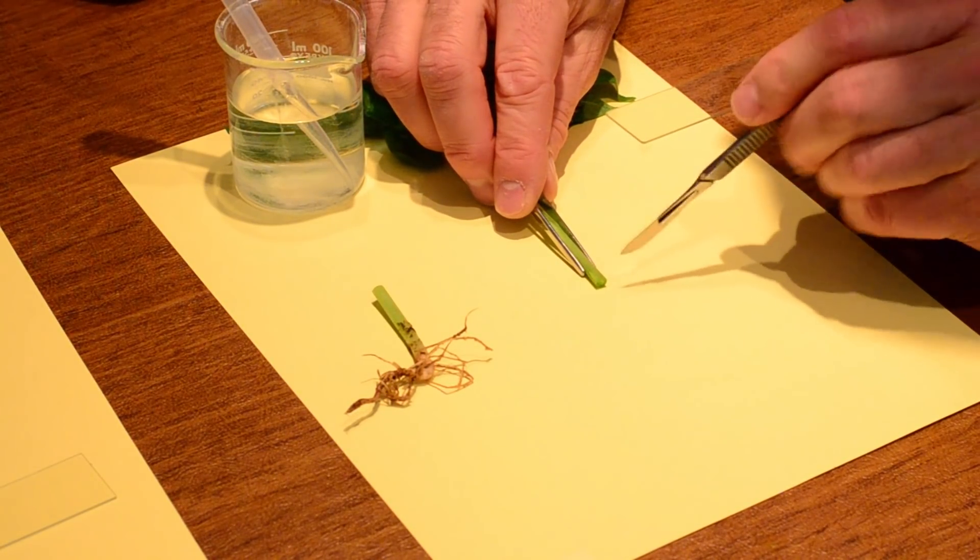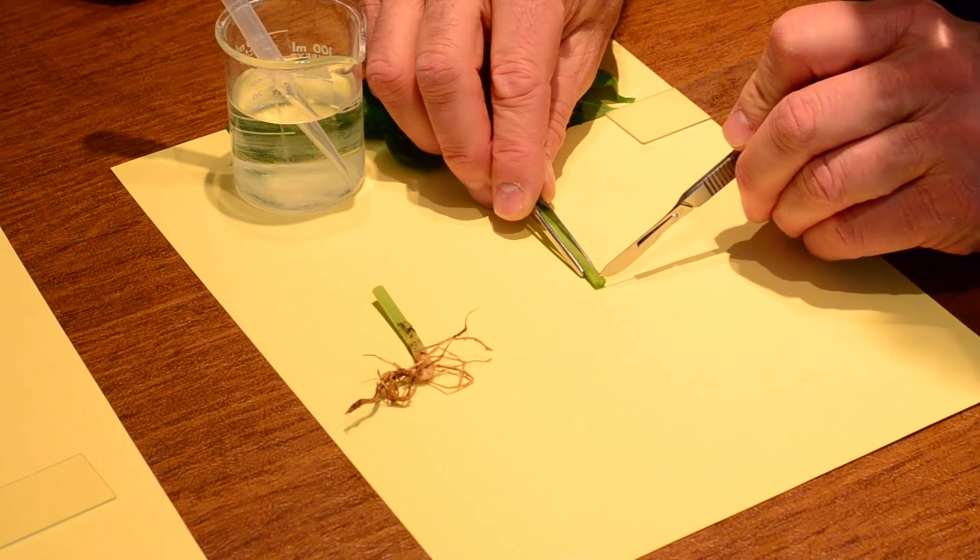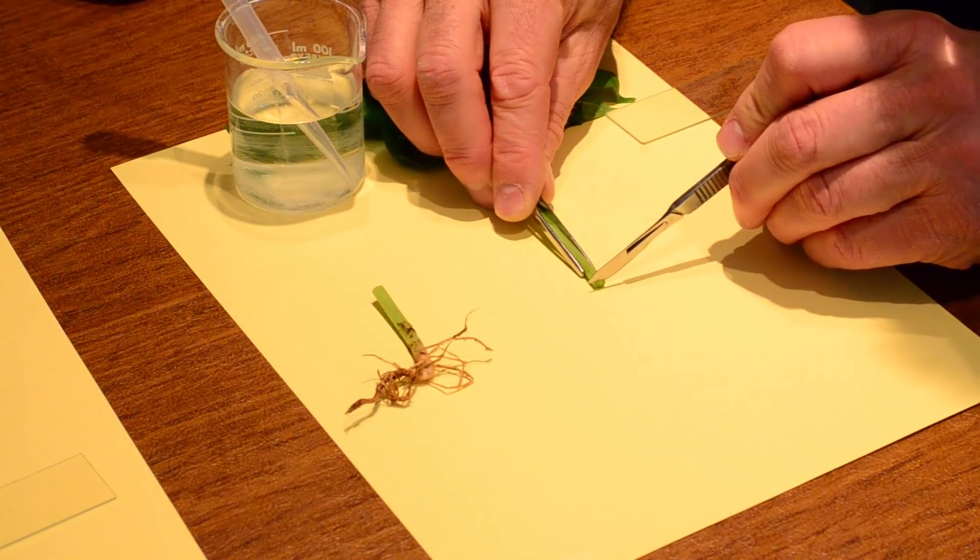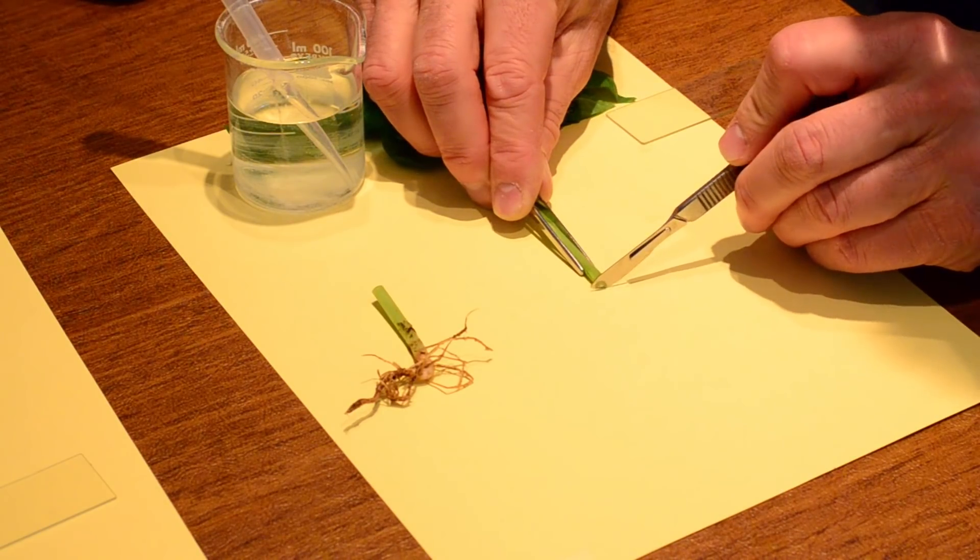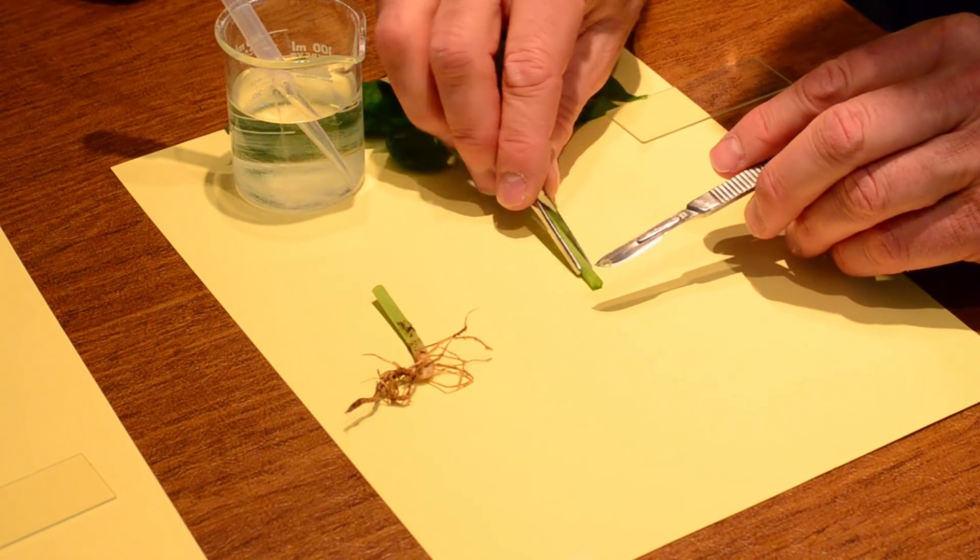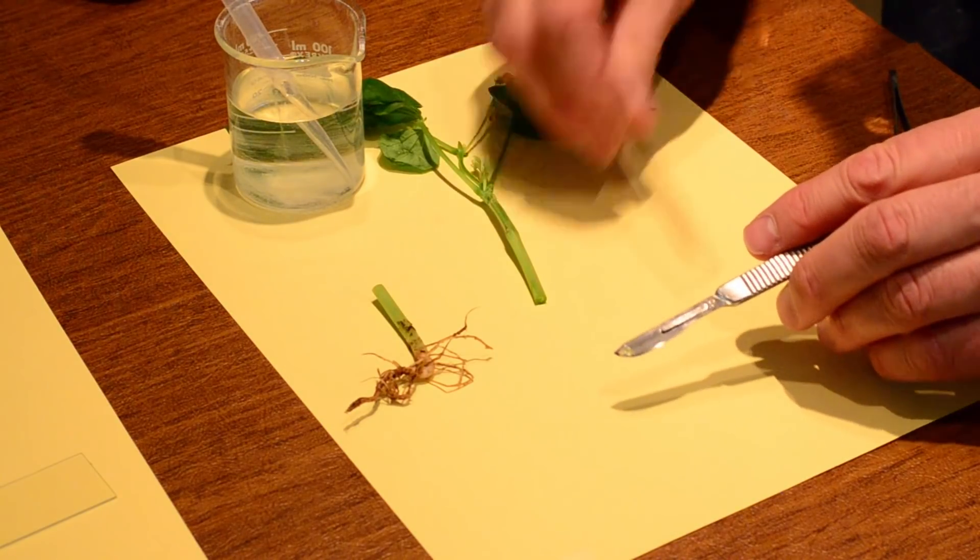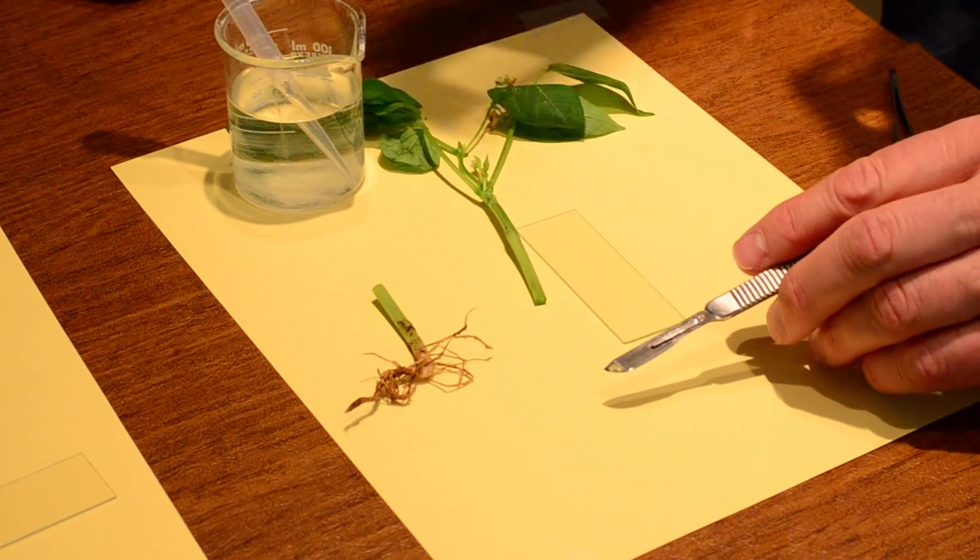And so I'm going to cut just a really thin sample. I want it real thin. Remember, I want that light to pass through. Now that's a pretty good cross section right there. It's not perfectly circular, but a real good cross section.